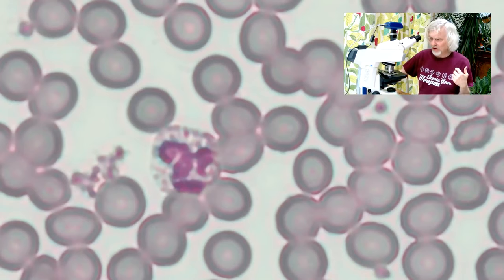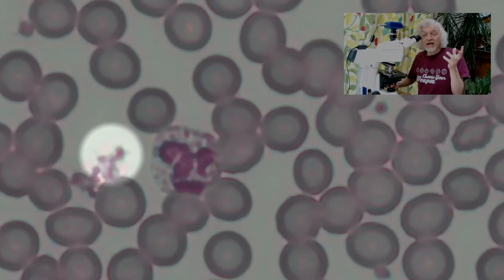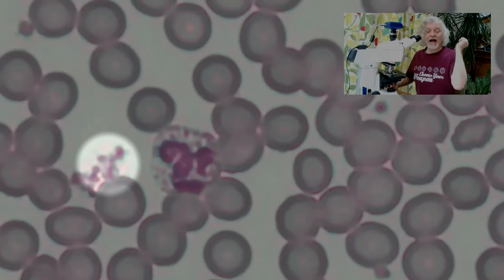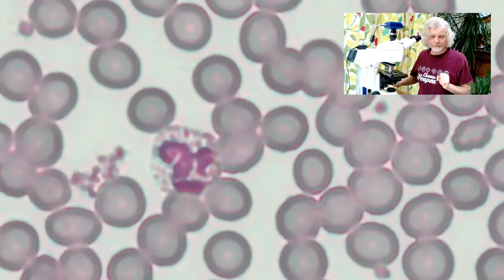And those, by the way, are probably platelets. Platelets are tiny little fragments of cell produced by the body, and they're what help clot your blood. So when you get a scab, what makes the scab is these little platelets. There's another one there, tiny little flecks in your blood.